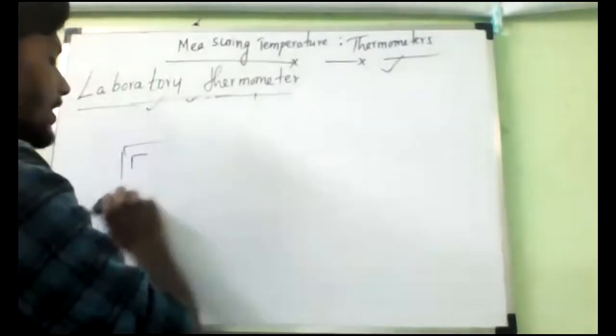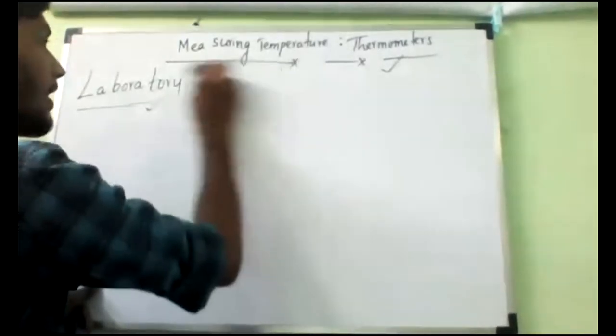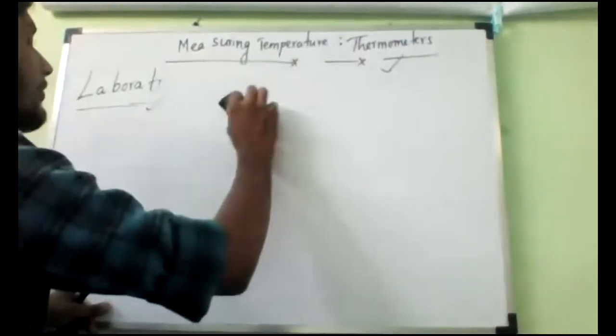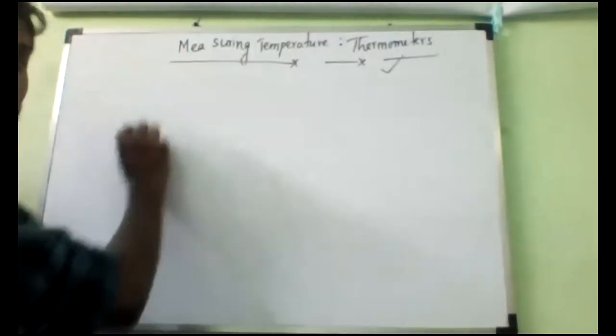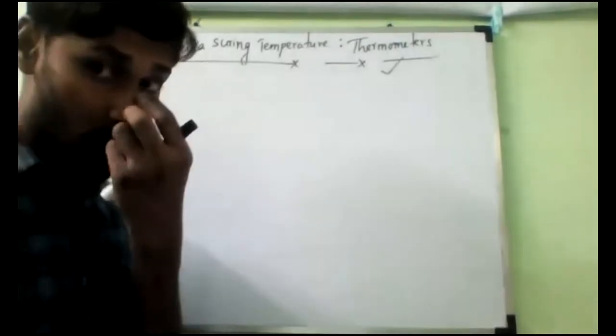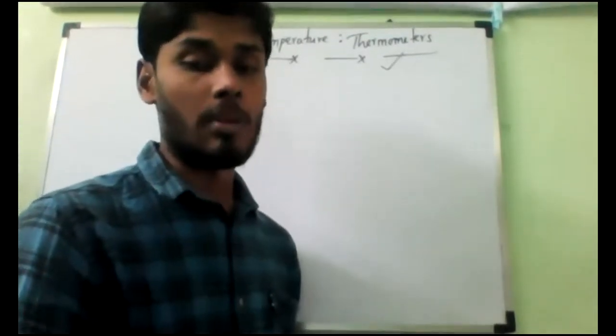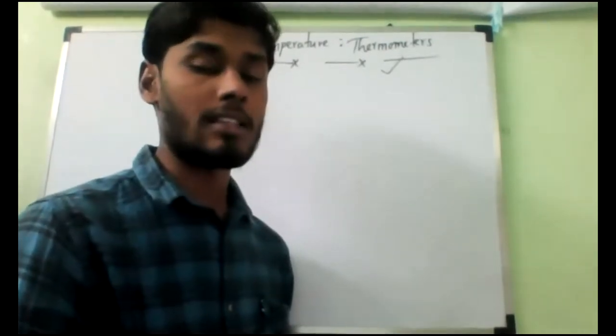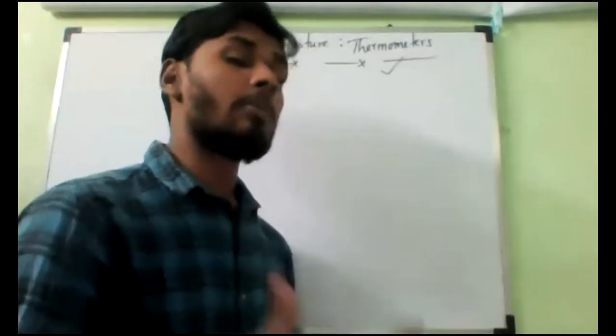Even nowadays we have smartphones, but before we didn't have them. By that time we had to measure the temperature in the daytime, afternoon, and morning, and that happened with the help of these thermometers only. Is it yes or no? So what we should remember is that this is what we call a laboratory thermometer.